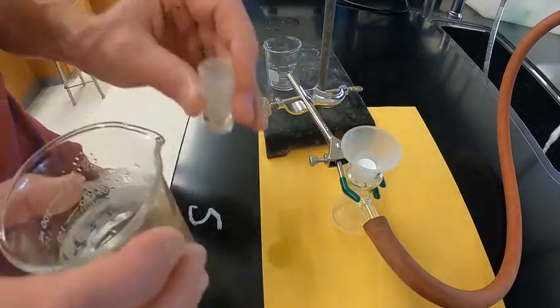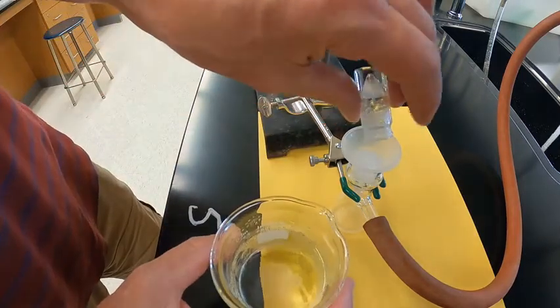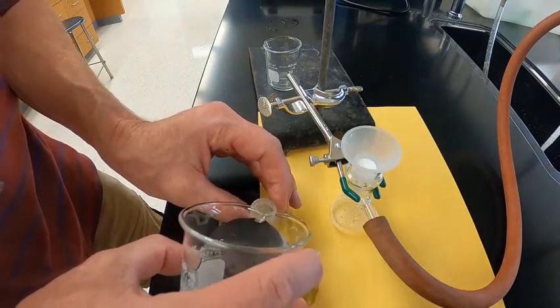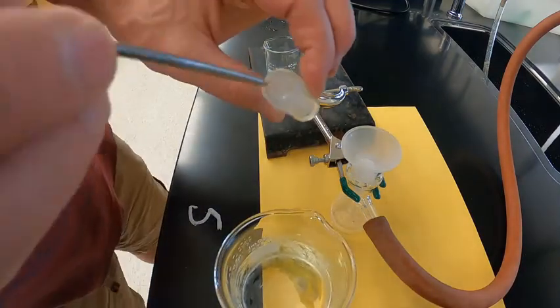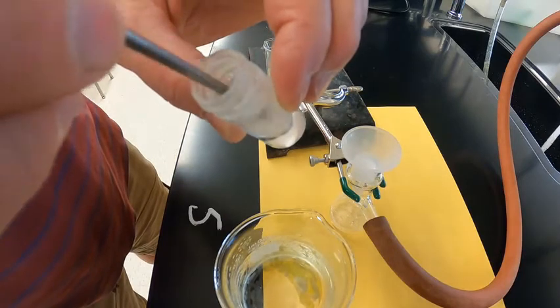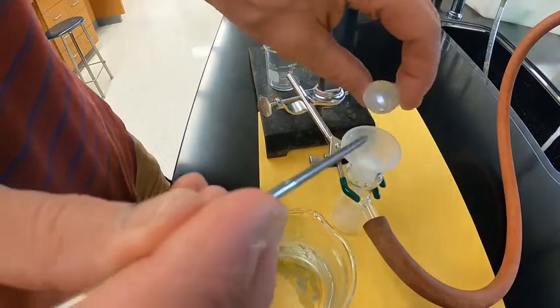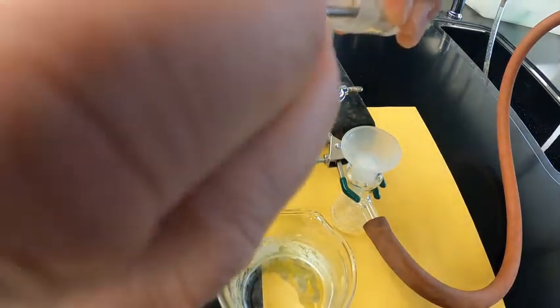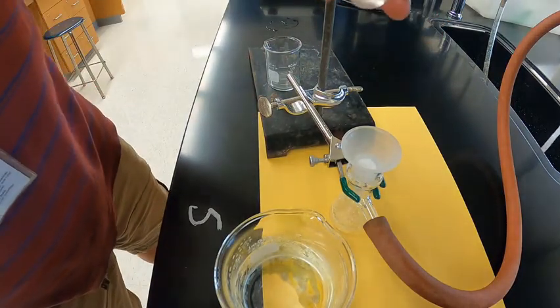So the simple method for that is you just add a little more water and swirl it some, and you can keep rinsing it. So I'm going to add a little more water. This time I'm going to use a real small scoopula to stir it up. So I want to get out even the boiling chips because some of my product could be locked into the boiling chips. So they're a little bit tricky to get out, but that's why we have the mini scoopula. So again, just keep rinsing it.